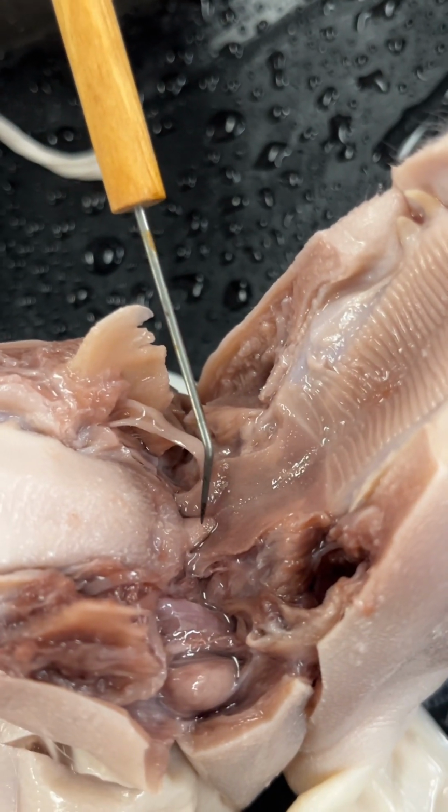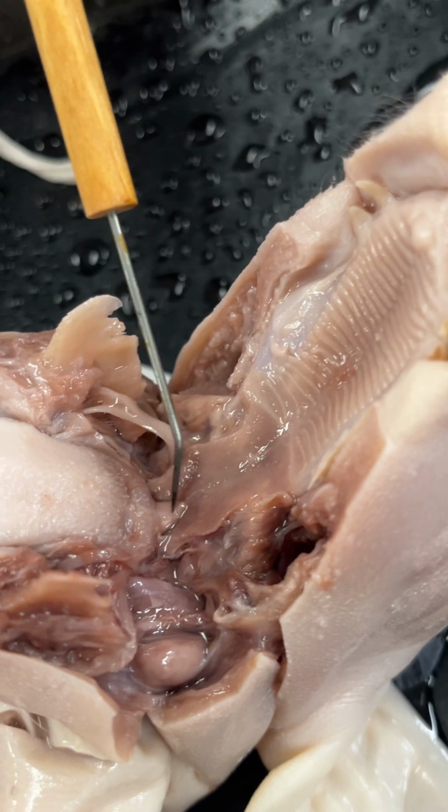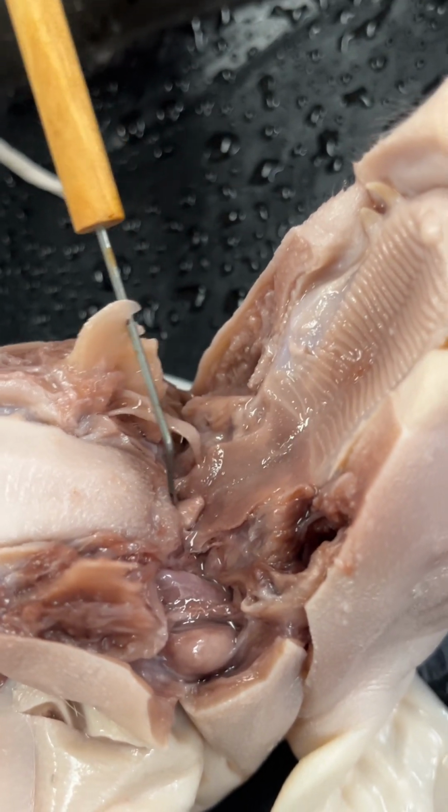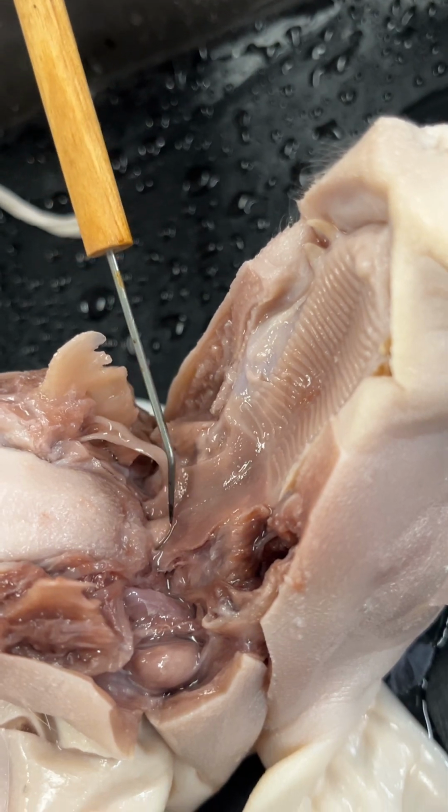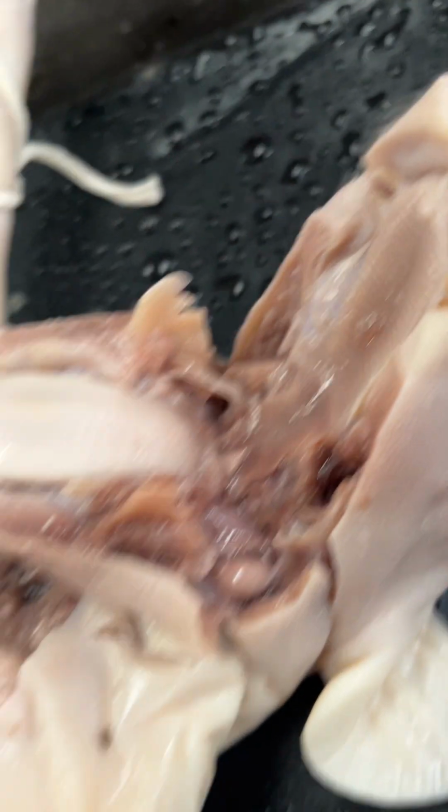This is the epiglottis. This is a flap of tissue at the base of the tongue that prevents food and fluid from moving into the trachea and lungs. Its function is to keep an organism from drowning while eating.